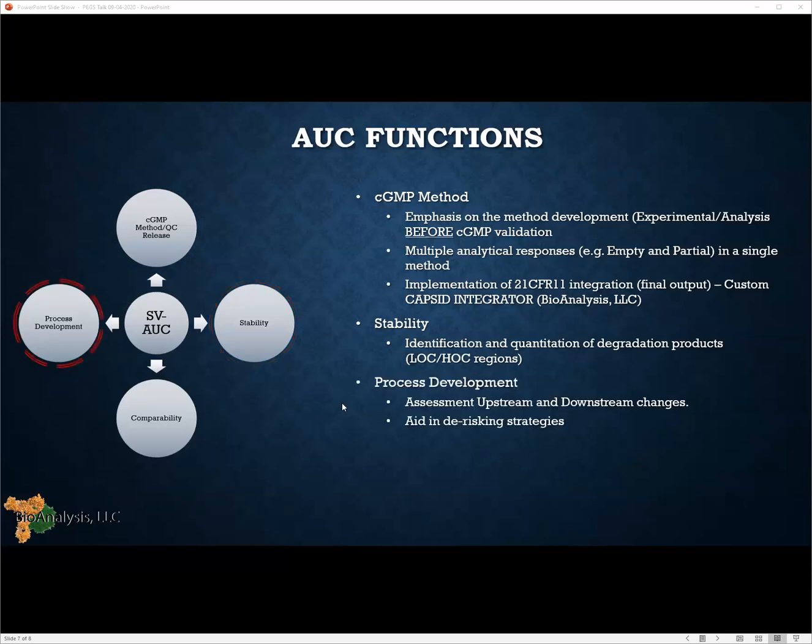In addition to that, SV-AUC can really help your process development, where you're making changes upstream and downstream. You're changing from a cesium chloride gradient to AEX chromatography.